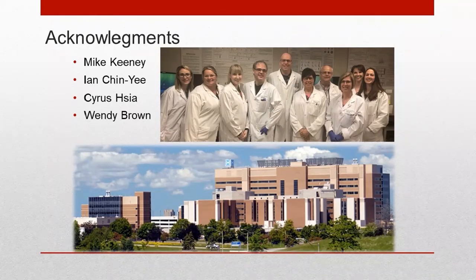Yeah, so everything for this product was calculated based on the study that I showed the brief version of at the end there. The settings are set up so that it collects 50,000 events, and the limit of detection was back-calculated to be 1%. You could actually go a little bit lower, but 1% is what was submitted to the FDA, so that's the limit of detection.